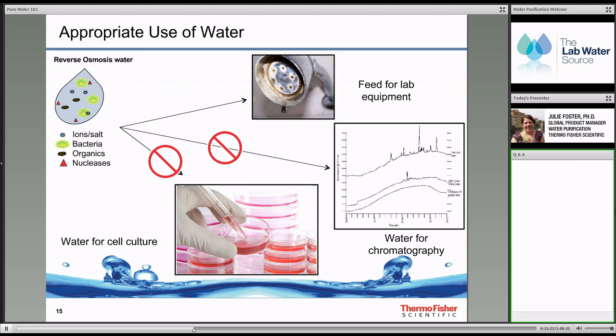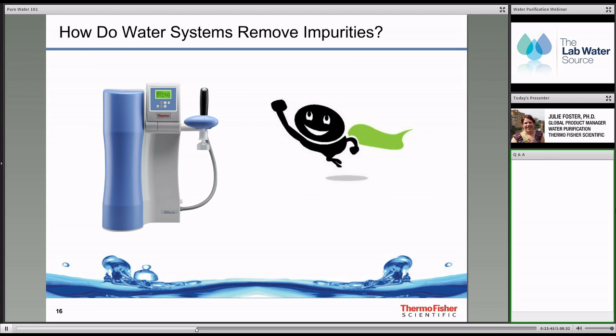So if you have water that's completely devoid of ions, there are absolutely no ions at all, the reading would be 18.2. So there's nothing beyond it. There's no such thing as anything beyond it. I hope that helps answer your question. If it doesn't, follow up with another one, and we'll address it in the Q&A.